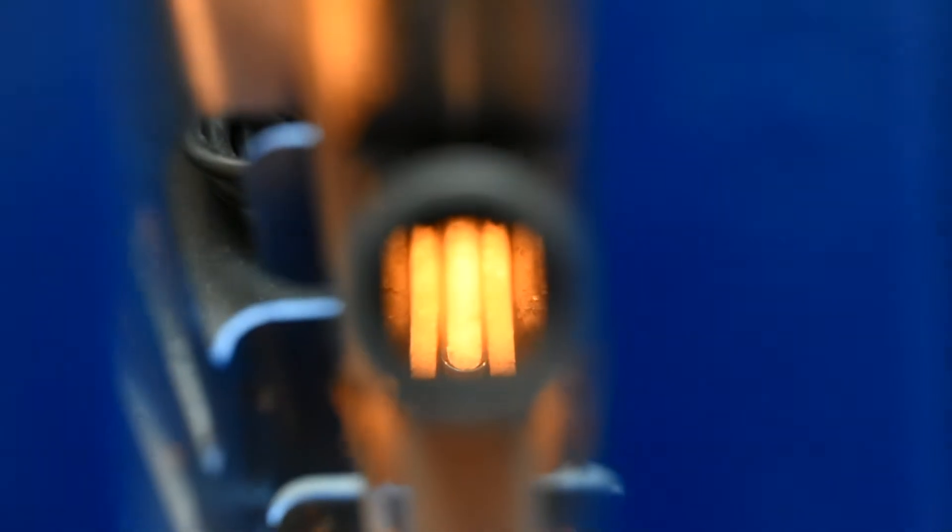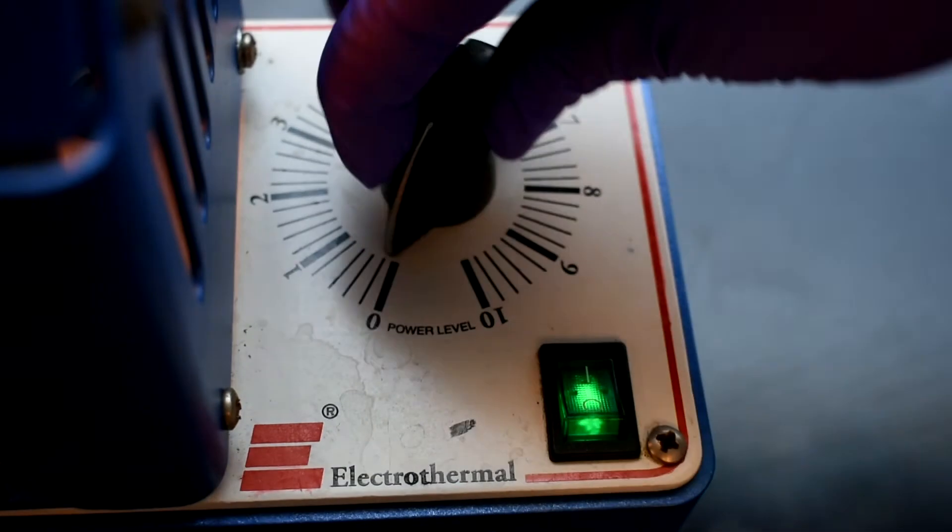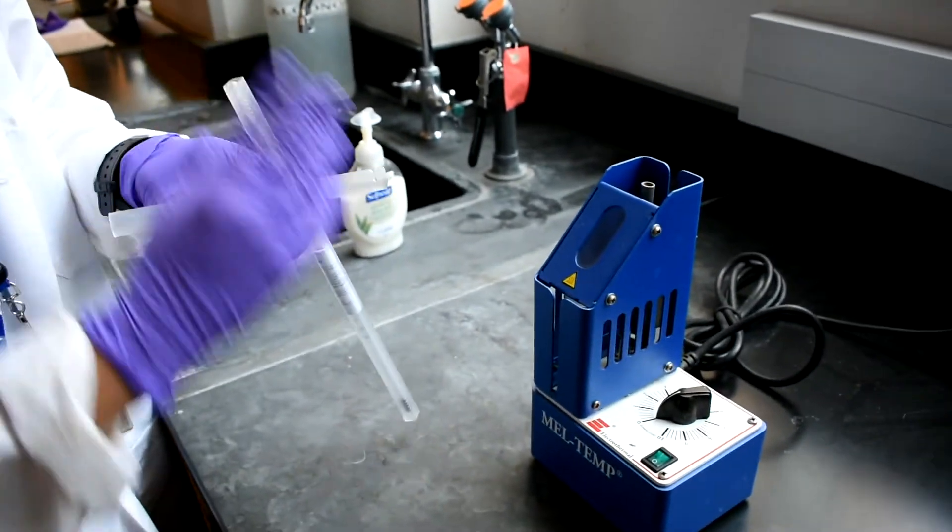Use the viewing window to monitor the state of your product. Allow the temperature to increase until the product begins to melt. Record a melting point range: the point at which melting begins is the lower limit, and once melting is complete, record this value as the upper limit. Turn off the Meltemp and allow the instrument to cool before removing the thermometer. Dispose of the capillary in the broken glass container.